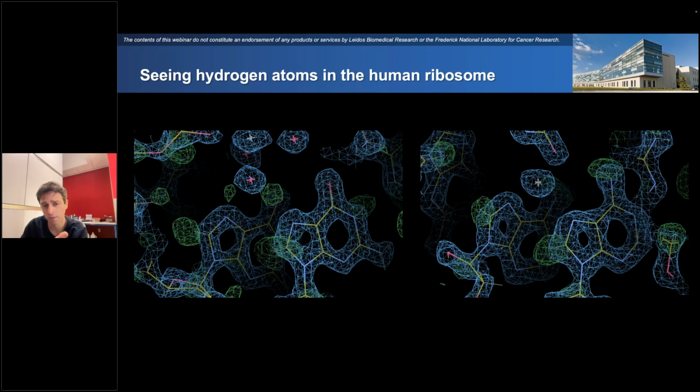But the other thing I'll mention is that for the hydrogens on the water molecules, we can see them in the one on the left here, but the hydrogens on the water molecules are by far the most difficult ones to see in the maps that we have, and there's a lot of potential reasons why that could be. We have a couple of theories and ideas about why that might be the case, but being able to see the hydrogens on the water is actually very rare, even in a map that's as high resolution as the ribosome or beta-gal that we showed today. As an example, if you look in the screenshot on the left, to the right of the magnesium, the water on the right actually does not show the hydrogens, even though it's right there next to the water molecule that does show the hydrogen.